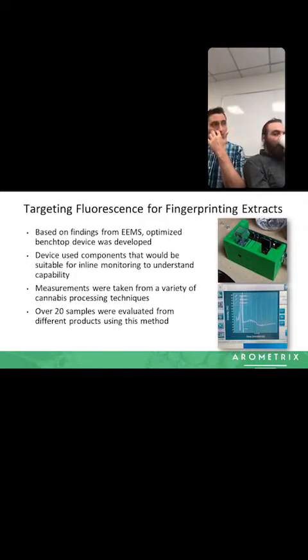Now, we could have used really expensive equipment, we could have used very high sensitivity equipment, but we always knew that the goal was to have a system that could be made to work in situ, to work during the process. So from the very beginning, we only chose pieces of equipment that were conducive to this kind of online monitoring, because it didn't matter if we had really expensive, fancy equipment. It wouldn't have mattered because it needed to, in the end, be inline.